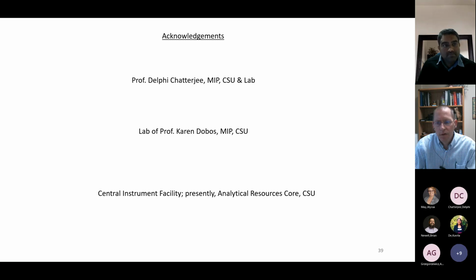I'll jump in with a question. You mentioned algorithmic interpretation of MS/MS. There have obviously been a lot of tools developed around that for small molecules, and one of the limitations, even with all of the data that we have available, is that there are not enough standard spectra to train these models well and test them. Are there large libraries of authentic oligosaccharide standards that could be used to build such MS/MS libraries for training?